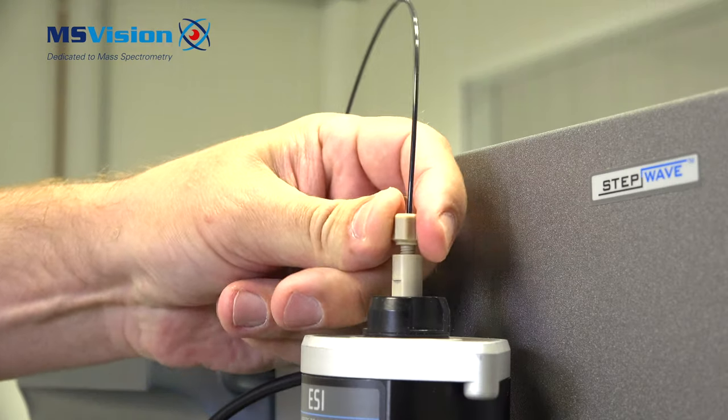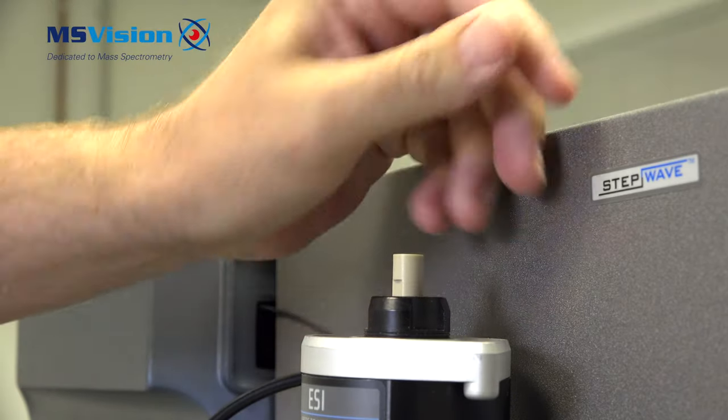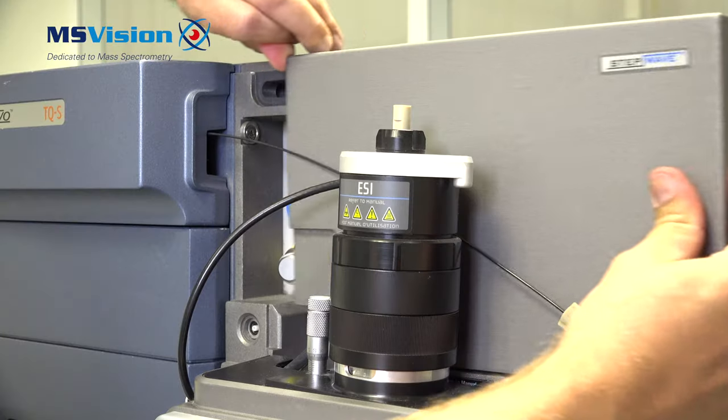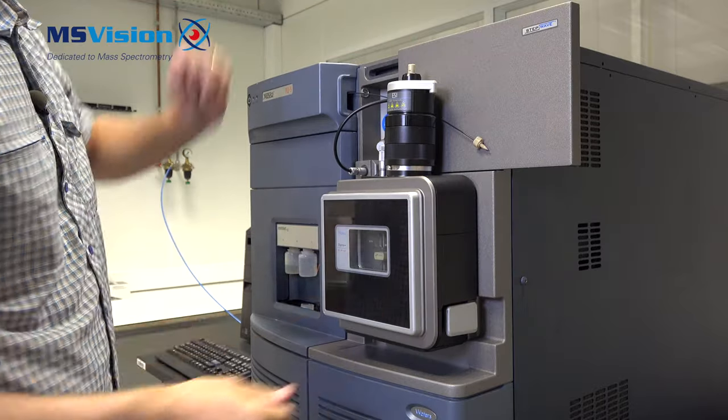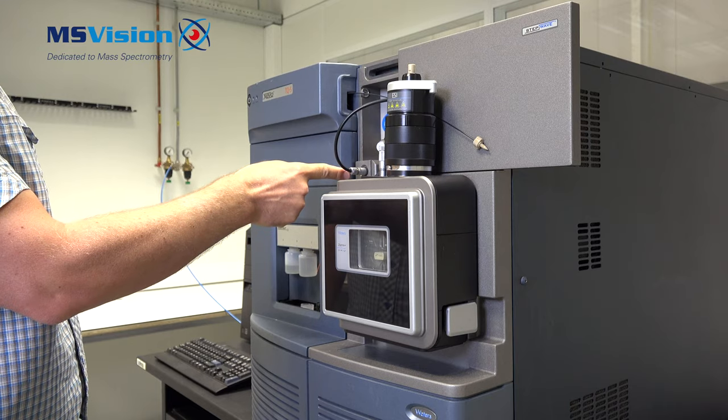First disconnect the inlet connection which is on top of the probe. Then slide open the door and behind here there's a large fissure connector and a small fissure connector for the capillary voltage.